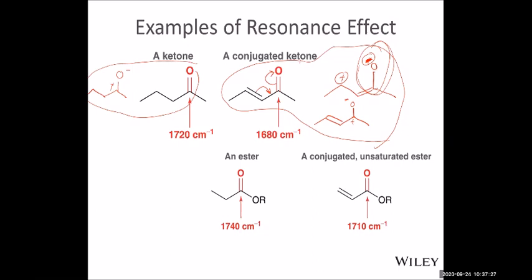And you can see the frequency decrease is a 40 wave number difference. That's fairly significant. And you can tell with these 2 compounds side by side, the carbonyl absorption has a fairly significant shift to the lower frequency or lower wave number direction.